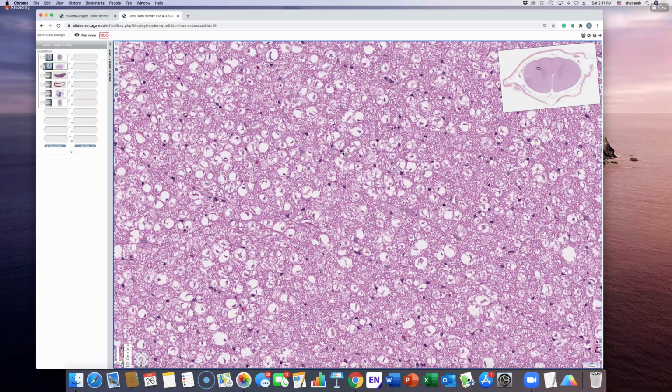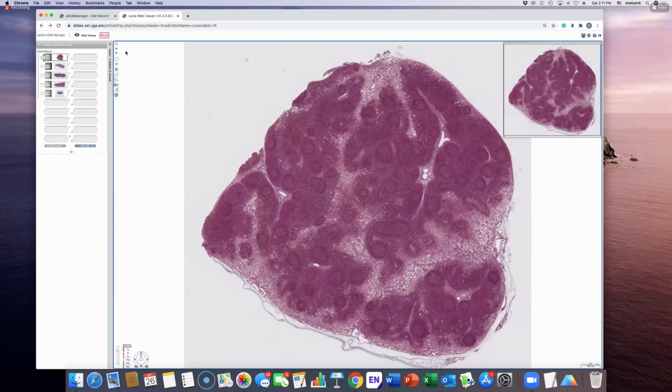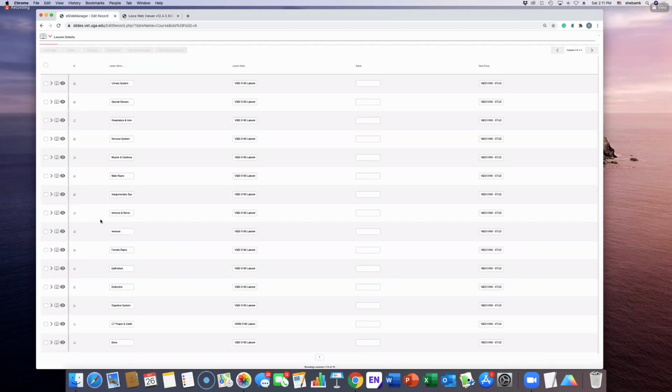Okay, here it's still an oligodendrocyte because you're still in the central nervous system. Okay, so now let's go to, where are we? Let me go to more nervous system.